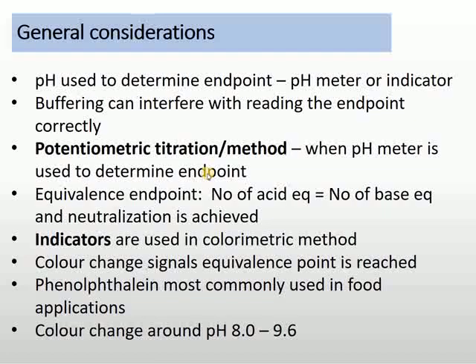So some general considerations: depending on the product, you have to choose whether you want to titrate using the phenolphthalein indicator, or you want to use the pH meter.